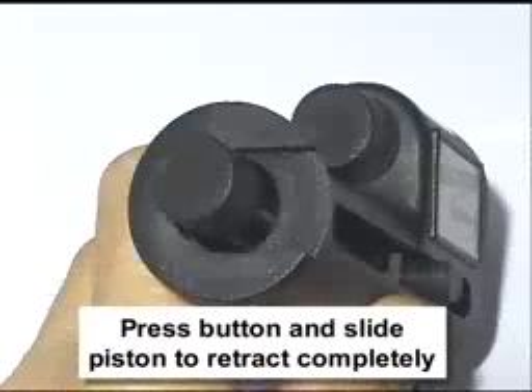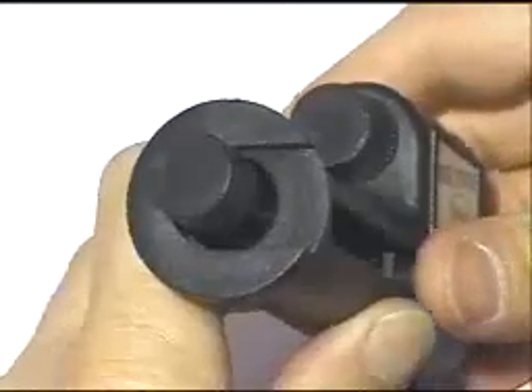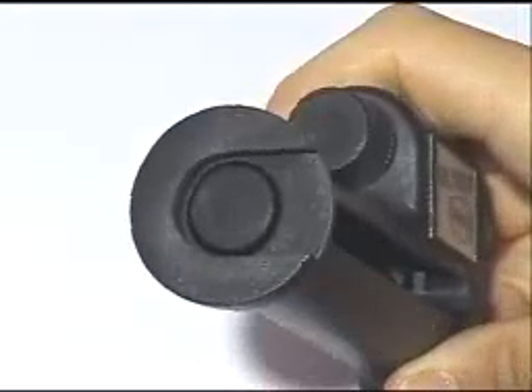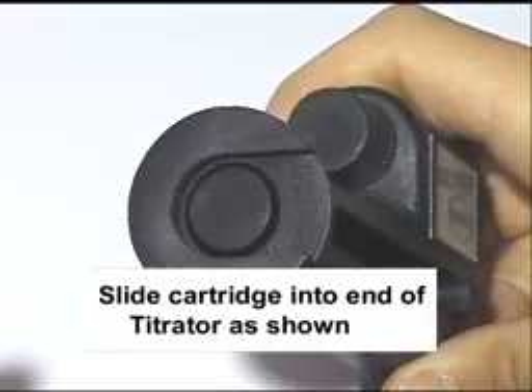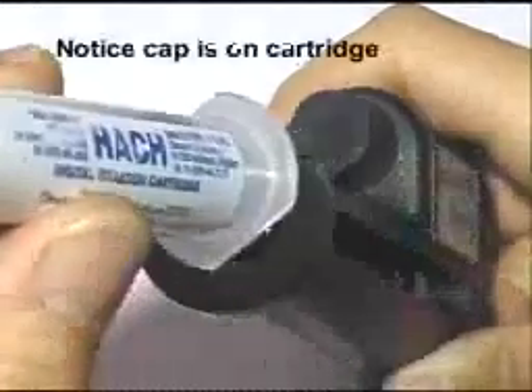Press the button and slide the piston to retract completely. Slide the cartridge into the end of the titrator as shown. Notice the cap is still on the cartridge.